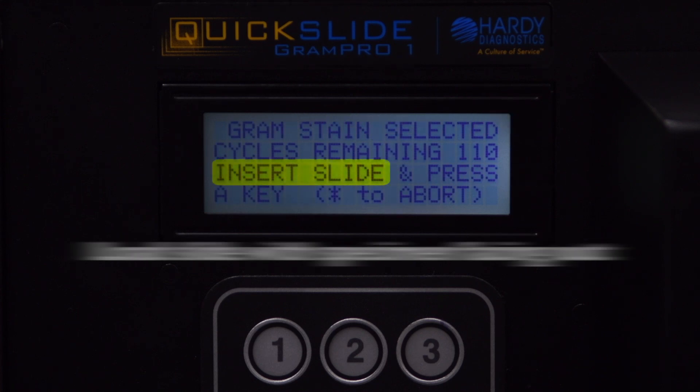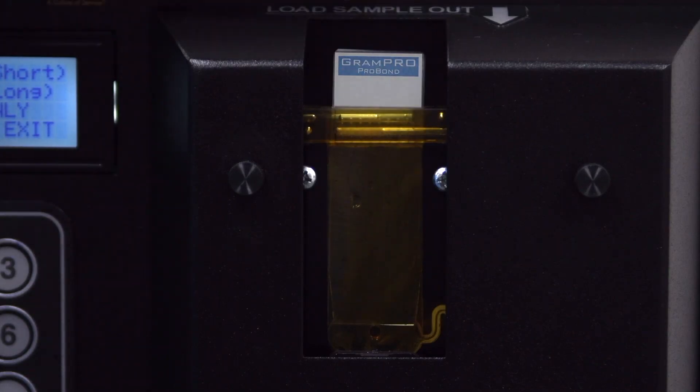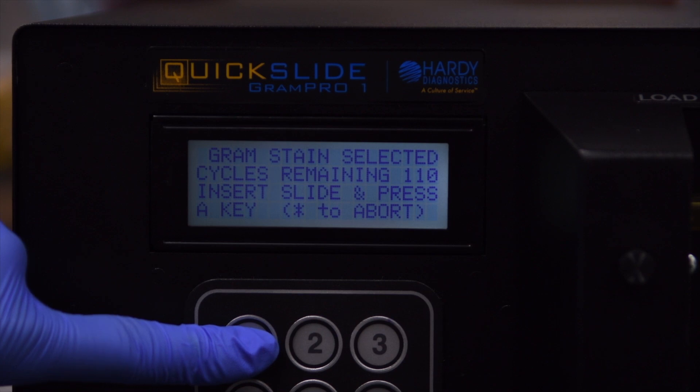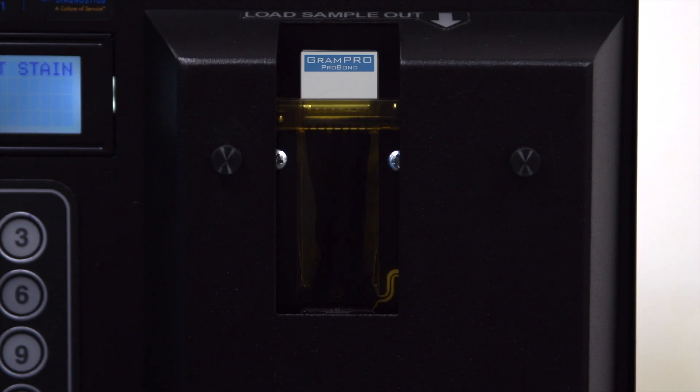When the screen prompt reads Insert Slide, lower the slide gently into the cuvette. Press any key on the keypad except the star key to commence the automated Gram staining. The unit may now be left unattended as the slide is stained.